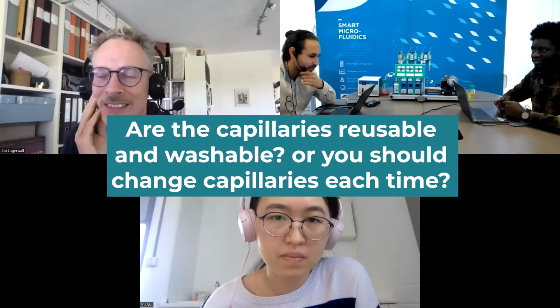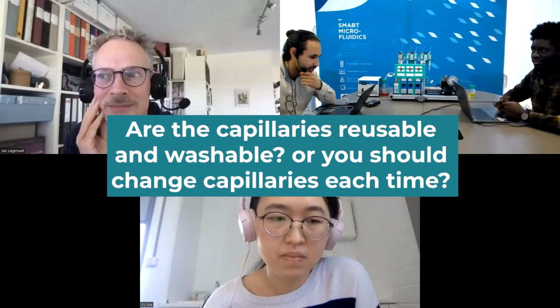Okay, there is another question. Yeah, well, that's for Adam, I think. Yeah, okay, thank you, Jan. Are the capillaries reusable and washable, or should you change capillaries each time?